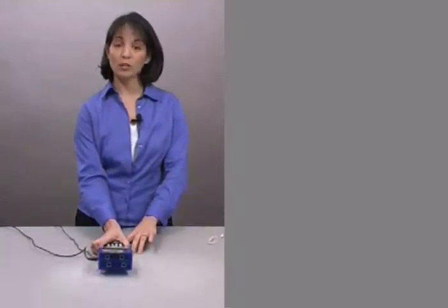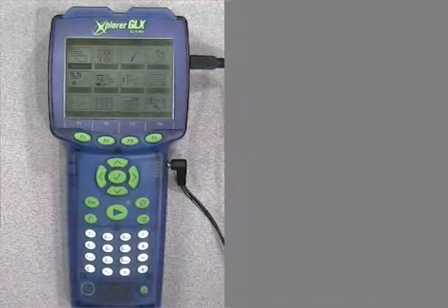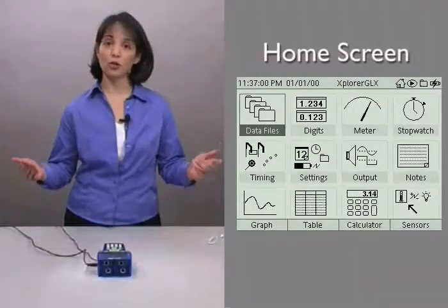The first thing you want to do is make sure that your Explorer GLX is powered on. You do that by pushing the power button right here. When it does turn on, it opens to this home screen.